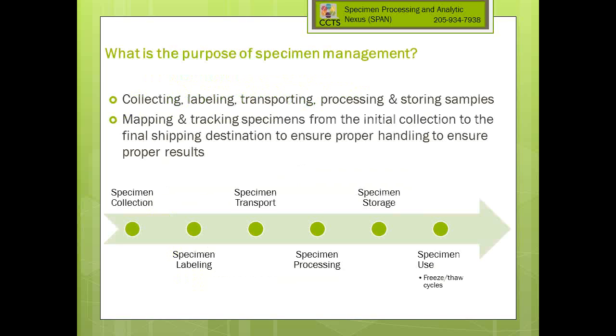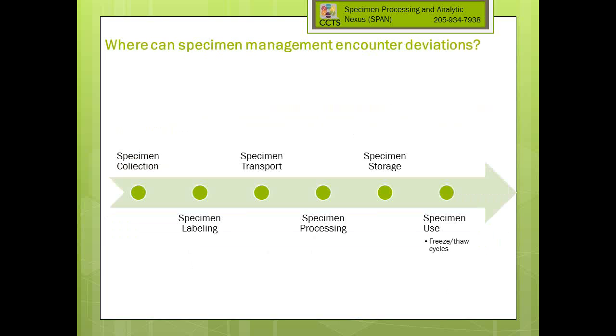So we talked a little bit about the collection of samples. What I'd like to move on to now are some of the other issues related to specimen handling after you collect them.